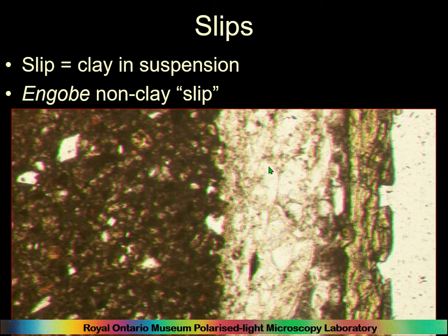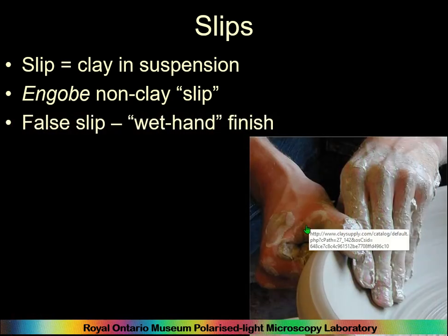It's probably not true stone paste, but it is actually made up of crushed quartz, which may actually be one of the ideas behind the whole idea of stone paste, because this was made in Iraq, in Baghdad, before stone paste was developed. So in Basra and Baghdad, they were making a white slip for their pottery by using crushed quartz. Quite clever, really. So you might have things like that.